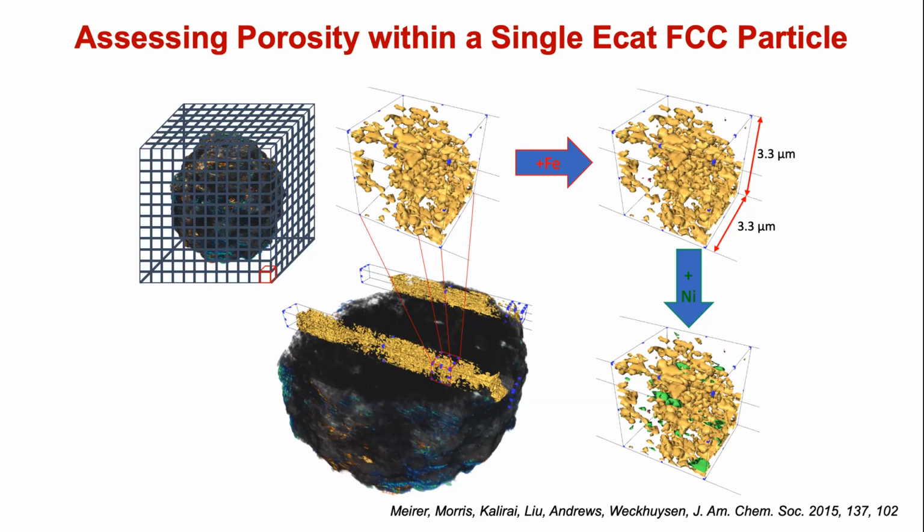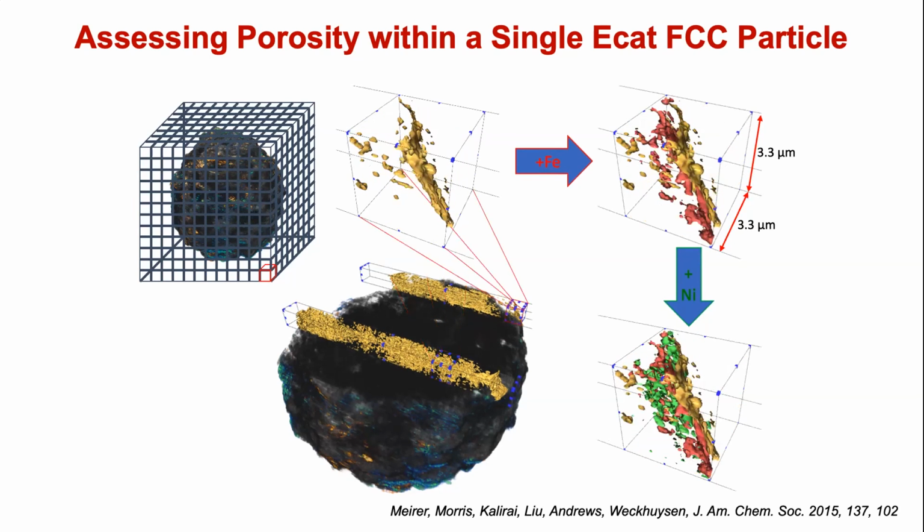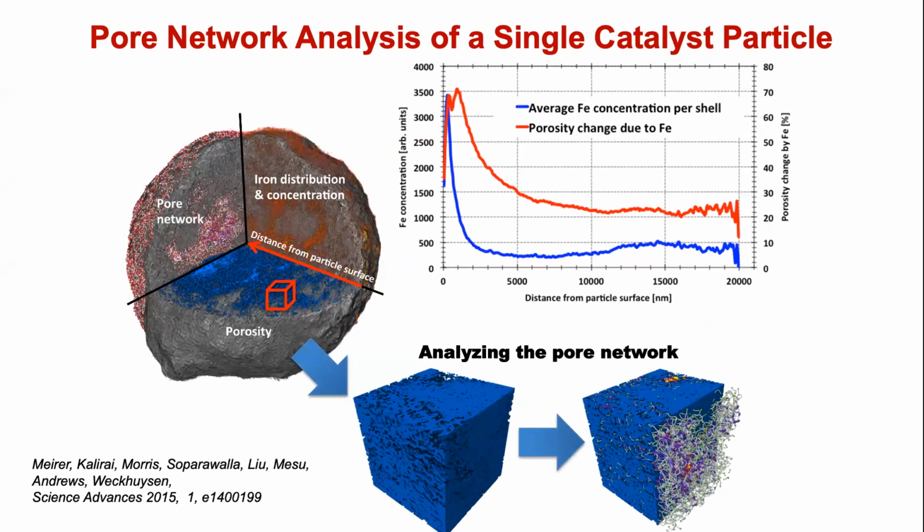So now I move to the outer part of the catalyst particle. Next one. And now you see that what you have is a shell of metal poisons. And when you go deeper and deeper, you have less. Actually, the metals are Pac-Man. They eat into the particle. Later on I will show that then also the zeolite is damaged. That comes later. So what you can do is analyze the pore volume. You can actually determine where it is.